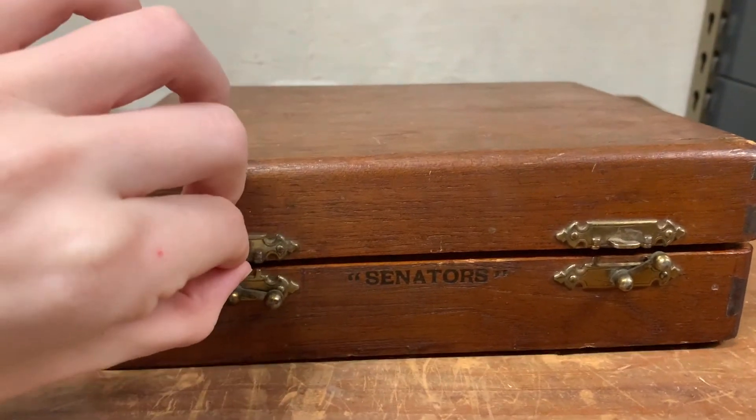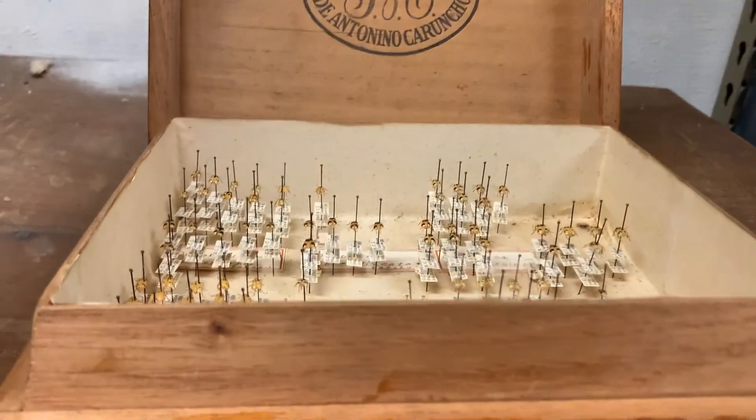Most likely you will pin your insects. For pinning your insects you need insect pins, tweezers, and foam. You might also want a pinning block so you pin your insect at the right height. Pin location will change from bug to bug. For example, for bees you might want to put the pin through the right side of the thorax in between the first and second leg. For beetles, however, you put it on the right elytra between the second and third leg. Look up what insect you have before you pin it to make sure you put your pin in the right place.